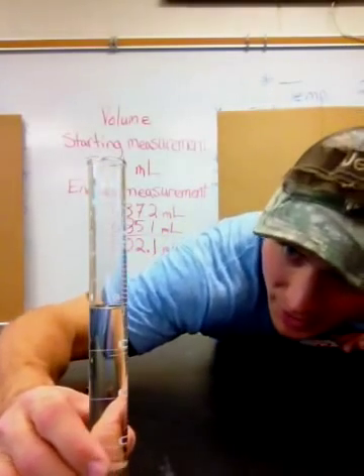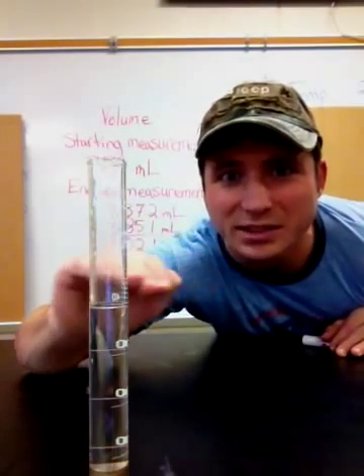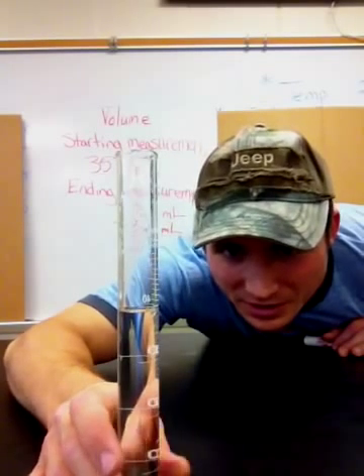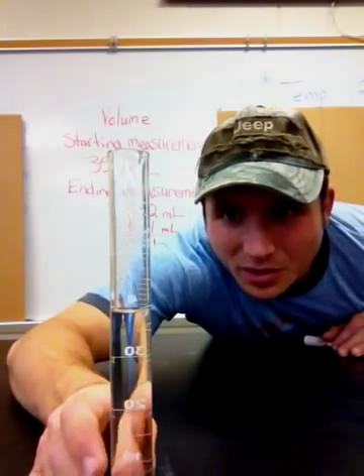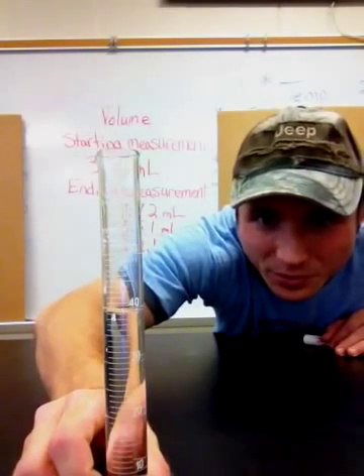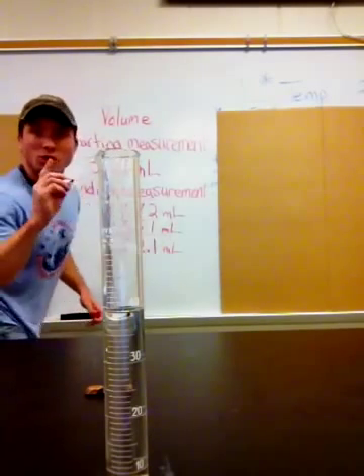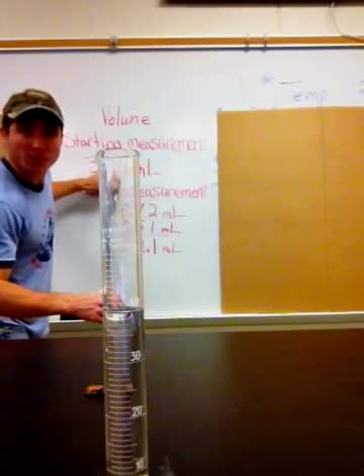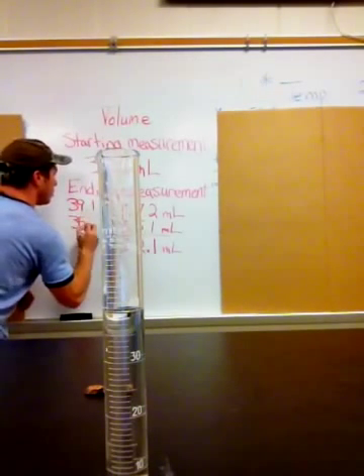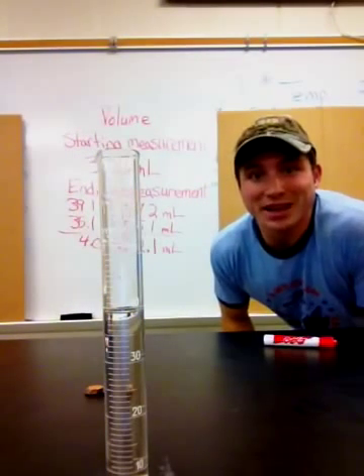Let's check and see what the measurement is. I'm getting down at eye level with the water so I can see right where the water crosses on my graduated cylinder. It crosses right above 39, so it's about 39.1 or 39.2. I take my new amount and subtract the original starting amount of 35.1, so 39.1 minus 35.1 gives me 4.0 milliliters — that's almost exactly double, so my reading was pretty accurate.